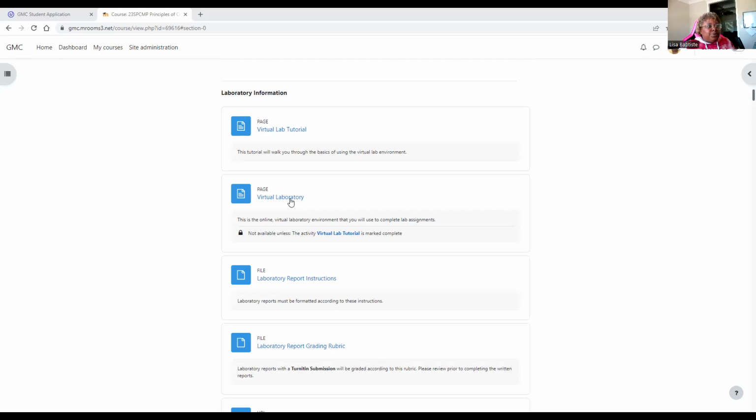And for this week's assignment, we are working with molarity and density. And you'll see that when you click on the lab instructions, it tells you to go down to the metals density problem. So you're going to click on that. And you see all of this information that's in your stock room. So you have distilled water, you have your three metals, because we're working with three metal unknowns that we're going to identify for this particular lab.